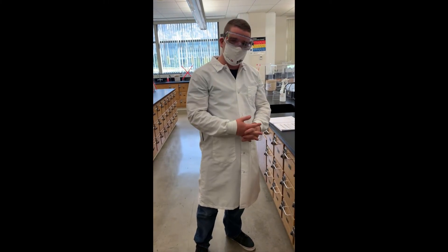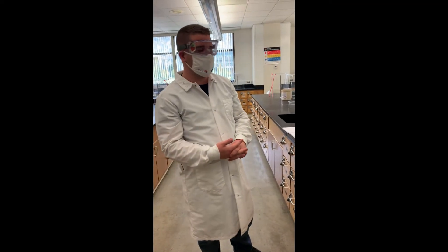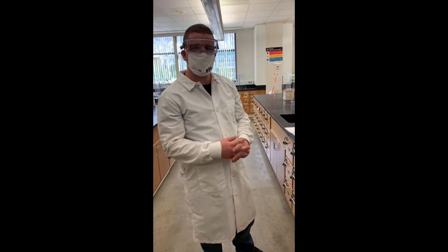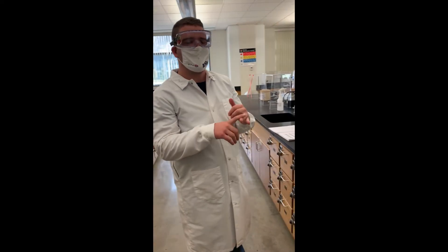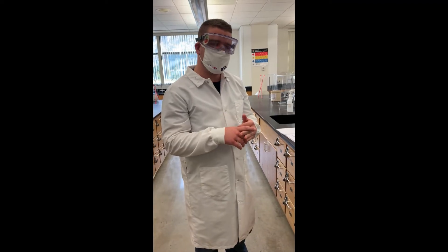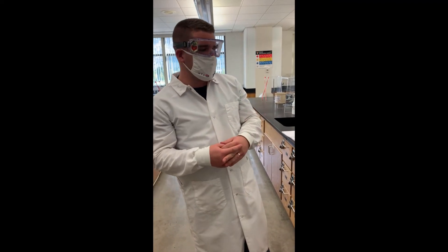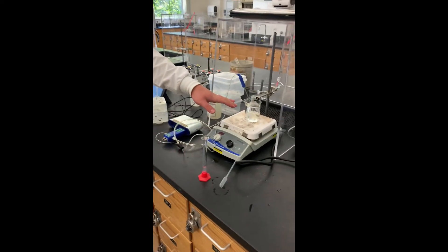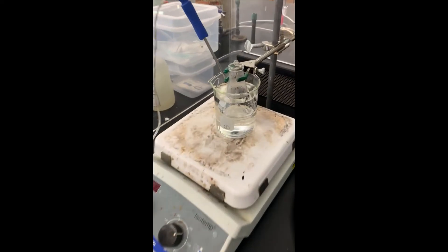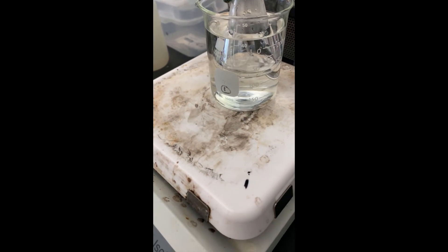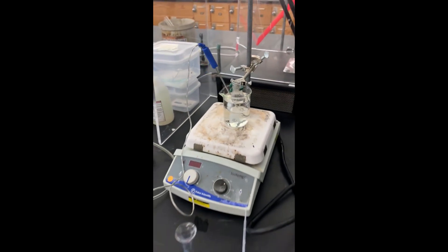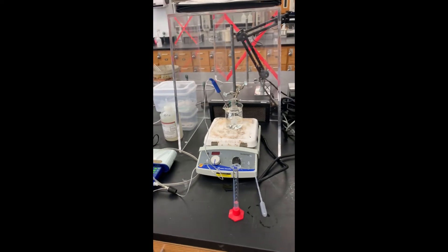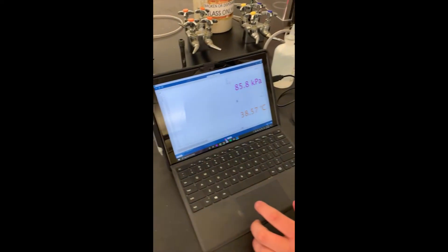Okay, so this is our last trial. This is going to be one of our temperature trials. I'm doing the same volumes as the first trial — three milliliters of catalase, one milliliter of hydrogen peroxide, and six milliliters of water. Instead, this time we have our Erlenmeyer flask sitting in a hot bath at about 40 degrees Celsius. So we're going to see how that affects the rate of reaction. Okay, so let's start.